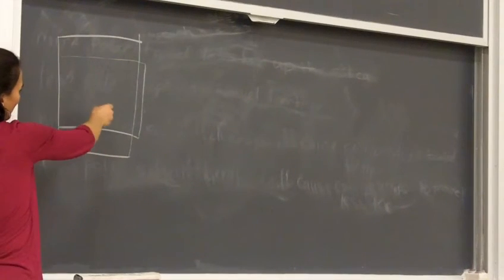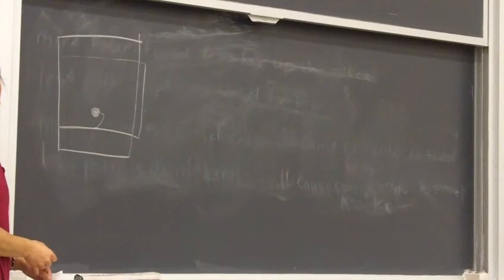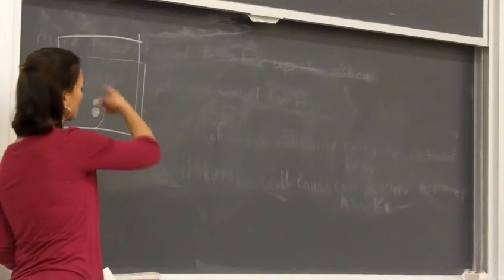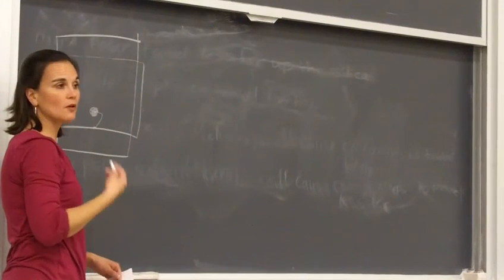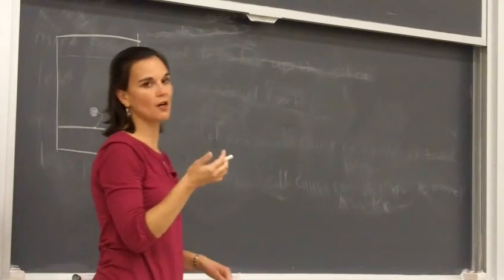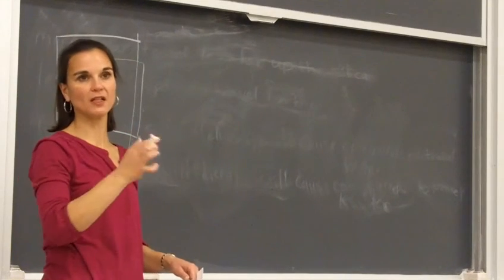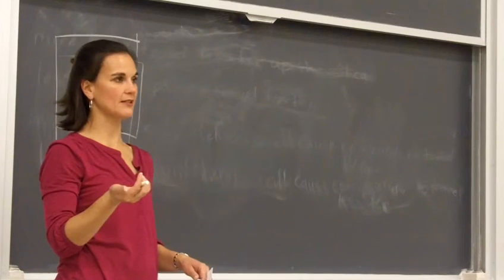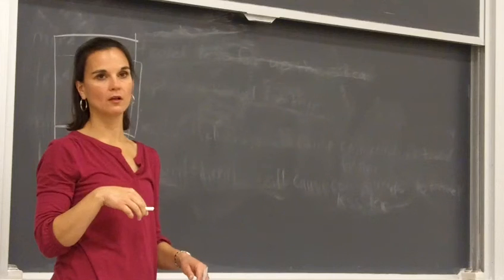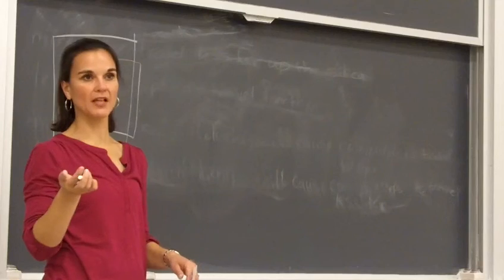So if we wanted to make this spot have a greater polarity, what would we do to the solvent? We would use a more polar solvent, okay? So like this week, we're using hexane ethyl acetate. A lot of times with TLC and column chromatography, you use a mixture of something relatively nonpolar. In our case, it's the hexane, and something more polar, which is, in this case, is the ethyl acetate. So what would you do to that ratio to make it more polar? More ethyl acetate relative to hexane, right?